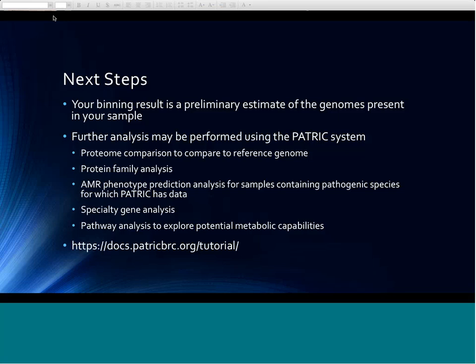Okay. So the follow-up to that, you may have covered this, is if so, what difference, if any, will coverage info make to the binning process itself? Lower coverage contigs are considered less reliable, and during the early phases of the binning, where we're looking for markers that indicate how many bins there are and what species they are, we're only going to look at the higher coverage ones. There are some coverage cutoffs in the early parts of the algorithm.